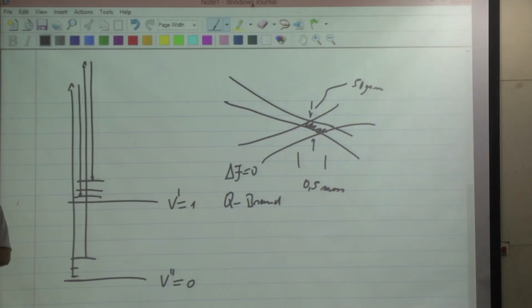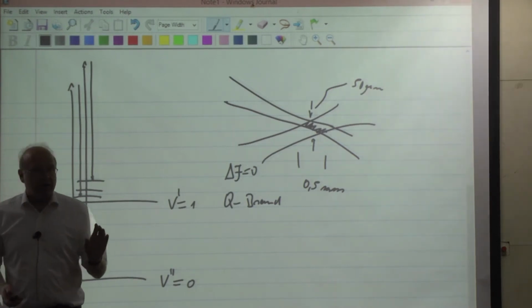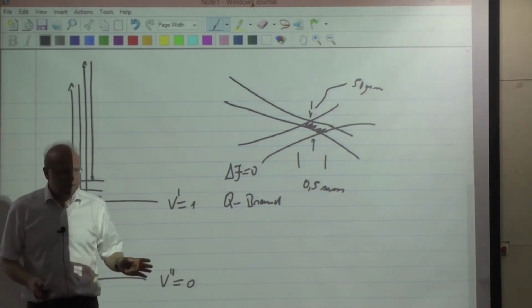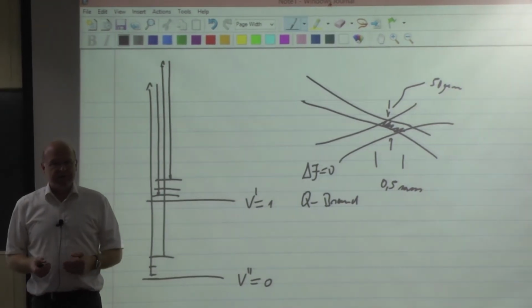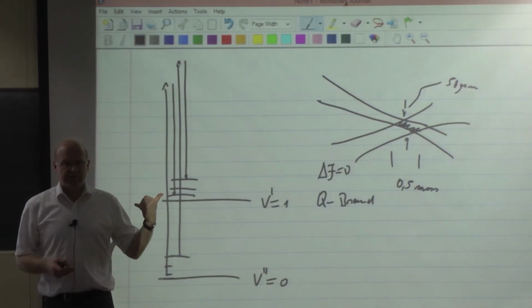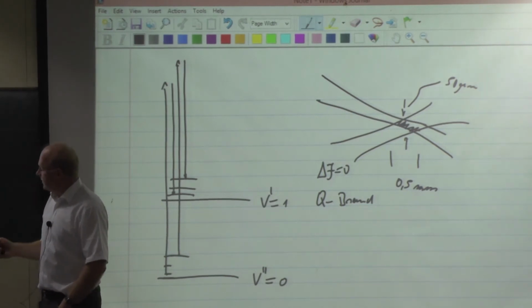However, those limitations in spatial resolution have been overcome by very recent approaches from Chris Kliewer at Sandia National Labs, and maybe I have some time later on to show you these recent developments where he was obtaining, even in this bad direction, something like 60 microns. Yeah? This is a different CARS setup, and maybe I have time to explain that.